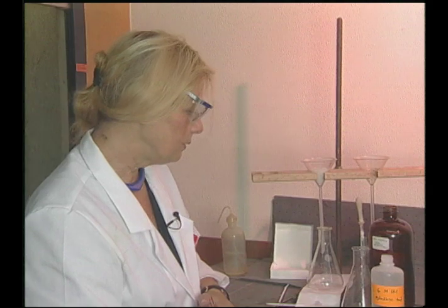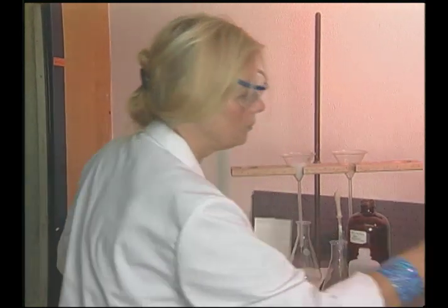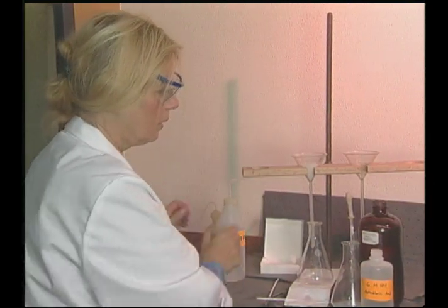And then when everything is done, you rinse it a bit with water or acetone, and then the process is done. That, ladies and gentlemen, is filtration.